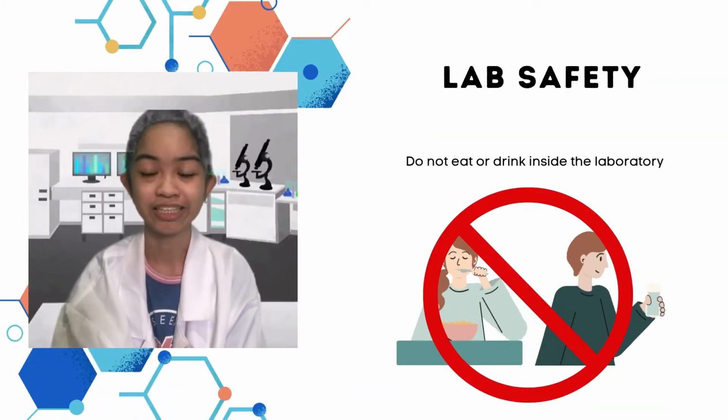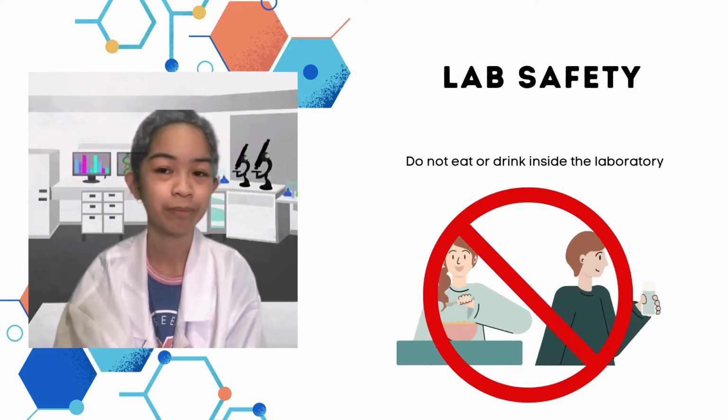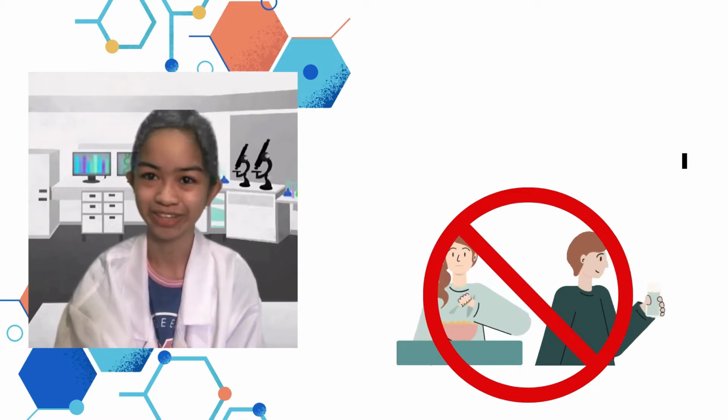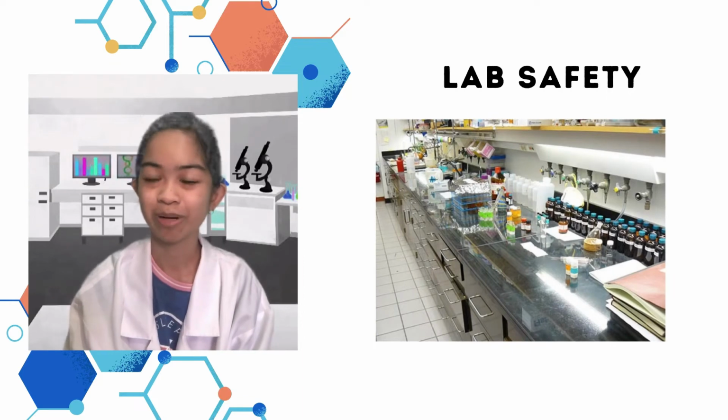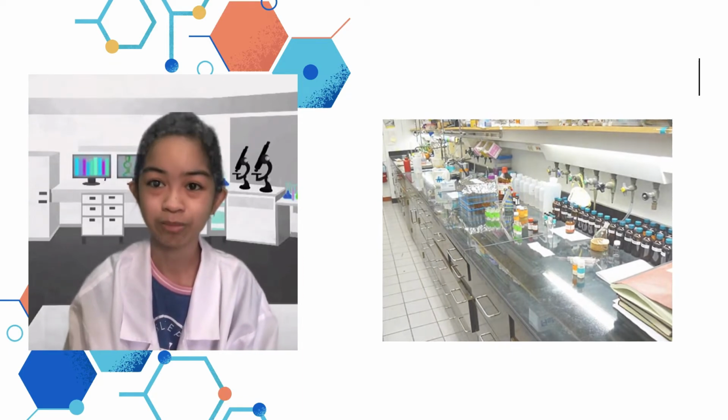Do not eat or drink inside a lab since you can contaminate your samples, and no one wants to start an experiment with a mistake that can be easily avoided. Other things that you should always remember are: first, keep your work area neat and free of unnecessary objects.